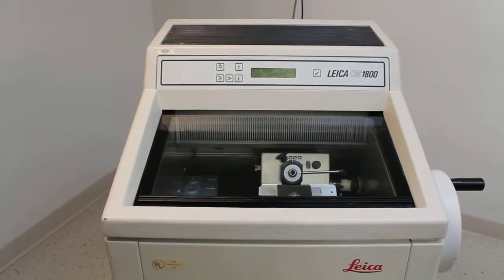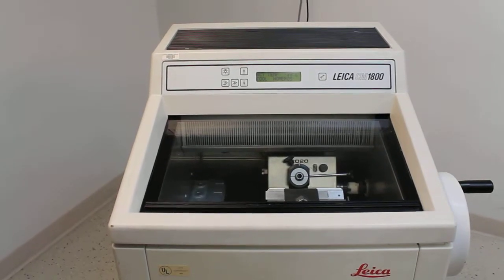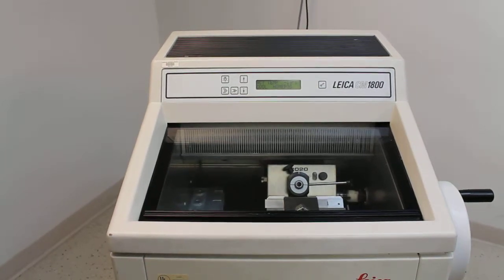This is the Leica CM1800 Cryostat. We just received this not long ago, and we just wanted to demonstrate a few of the features and give you a sense of the overall quality of the instrument.